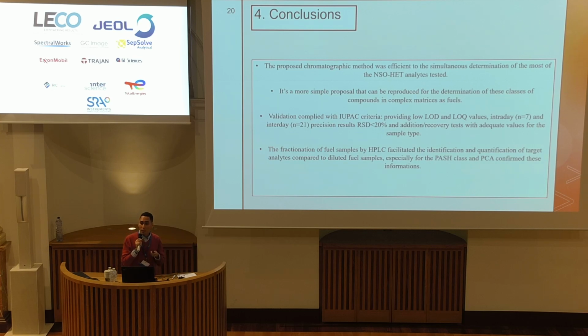The validation complied with IUPAC criteria with low LOD and LOQ, and adequate results for the precision and also for the recovery test that we applied. And the fractionation of the fuels by HPLC facilitated the identification and the quantification of the target analytes compared to the diluted fuel samples, especially for the sulphur class, and the PCA confirmed this information.